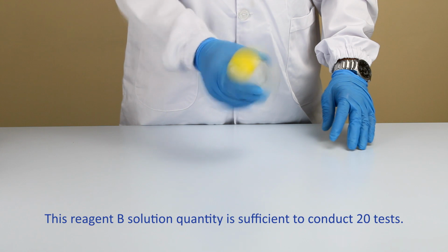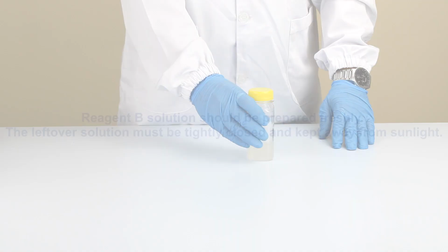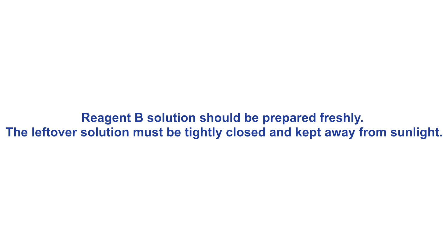This reagent B solution quantity is sufficient to conduct 20 tests. Reagent B solution should be prepared freshly. The leftover solution must be tightly closed and kept away from sunlight.